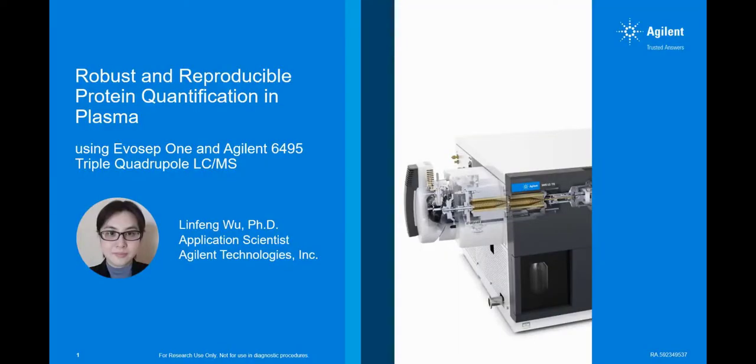Thank you, everyone. My name is Linfeng Wu. Today, I'm going to present our work for peptide quant in plasma using a new low-flow LC system called Evosep One, coupled to Agilent 6495 triple quadrupole LCMS with Agilent nanospray source.